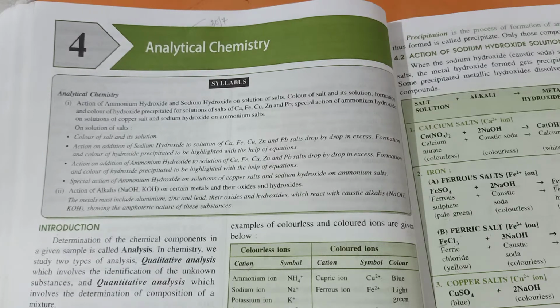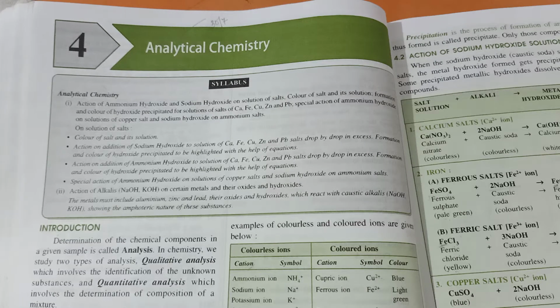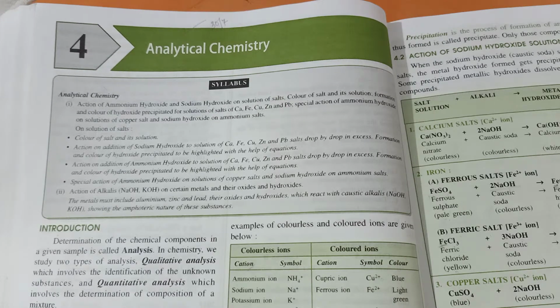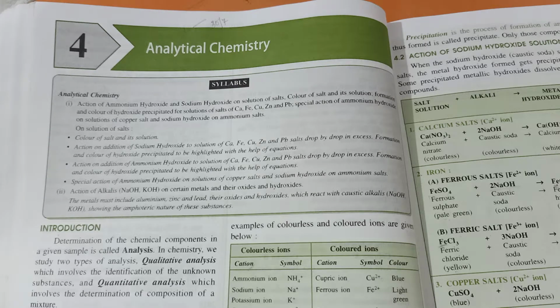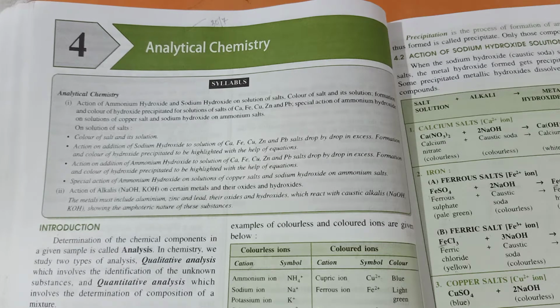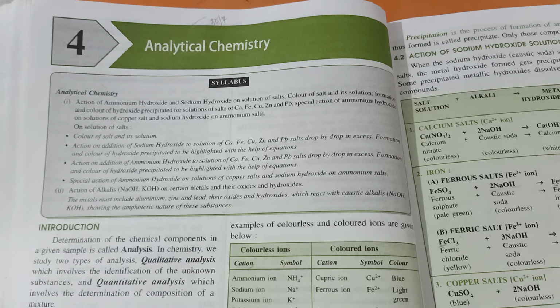Now, in our previous class, we learned about the action of sodium hydroxide solution on certain metallic salt solutions, and by observing the color of the precipitate formed, we figure out which metallic salt is given as the sample, and we also compared the solubility of the precipitate formed by different metallic cations.